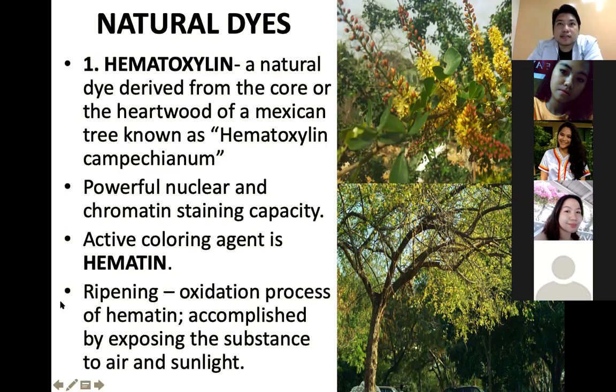Hematin is extracted from its source through ripening, the oxidation process of hematin, accomplished by exposing the substance to air and sunlight.